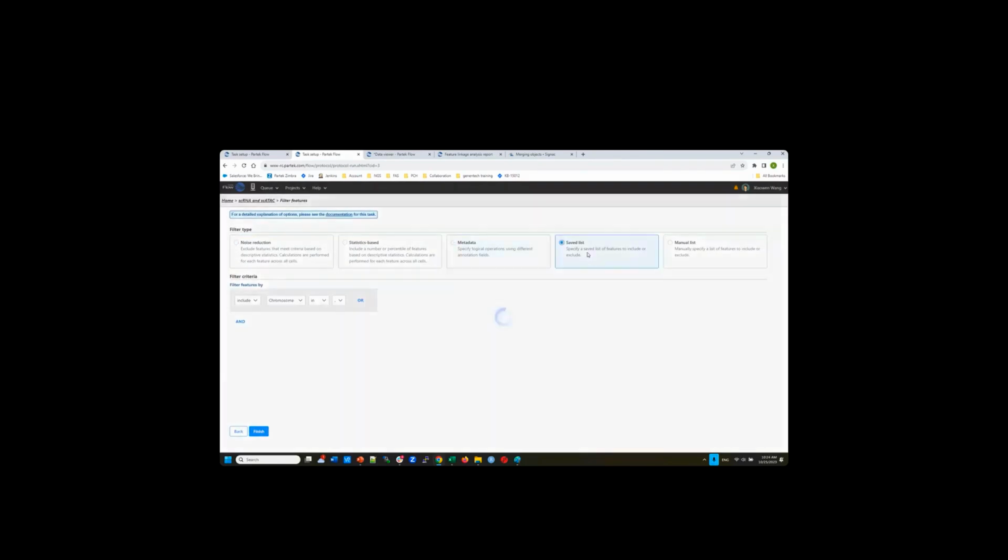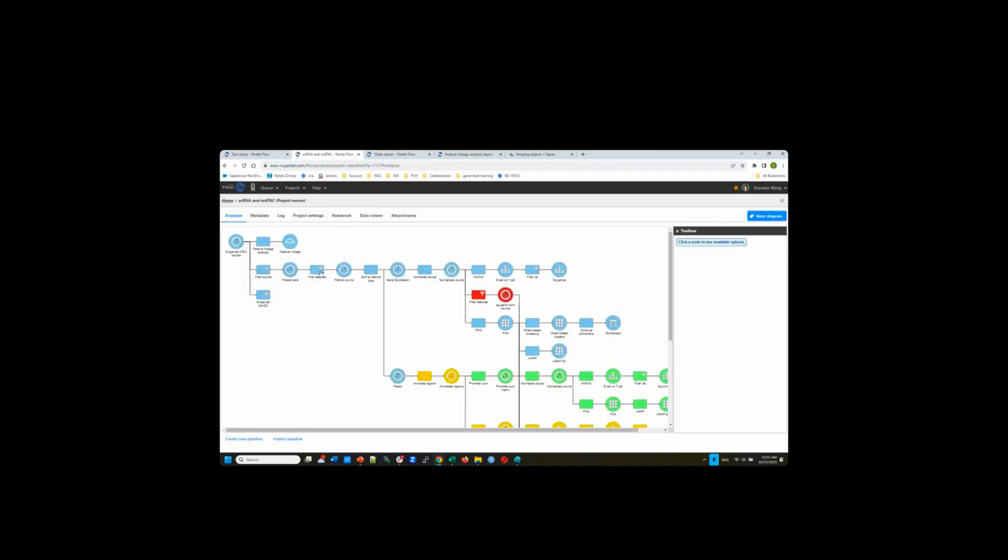Before, we listed the options on one page, which was kind of too long, but now we choose to do it this way. So you use noise reduction, and you can choose, if the value, basically now it's a raw count value, right? If the raw count value is 0, you say less than, and in what percentage of your data. If you only have 2,000 cells, less than 3,000 cells, and you say, hey, 99% or 99.5% of the cells, I will filter that out. Okay, so that will help you reduce your data. Your downstream analysis will be faster and also reduce the noise.